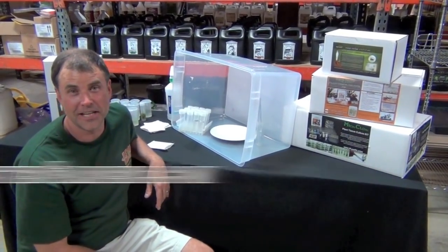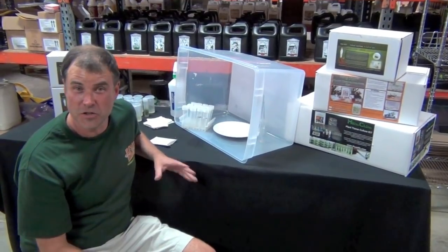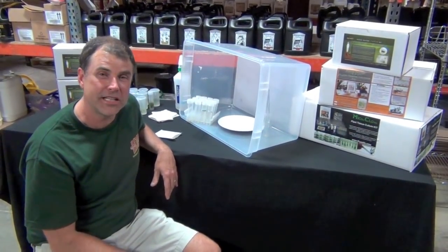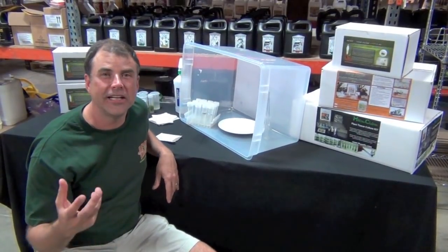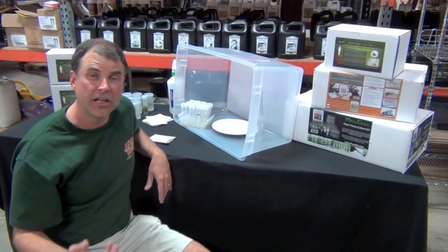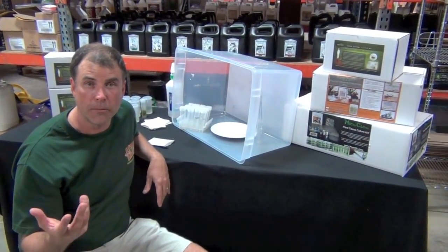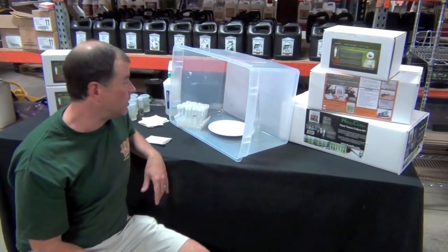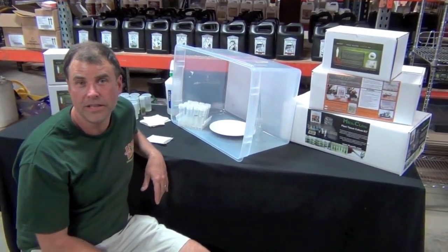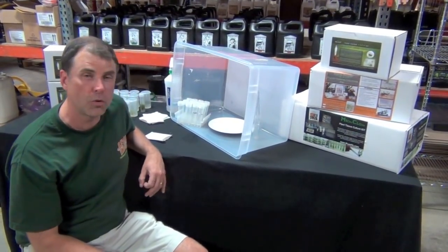You guys get to be the first ones to see this — this is brand new. What we've done is we have taken tissue culture techniques and created a seed starting kit for old seeds, or seeds that are valuable and just need an extra kick to get them going. It all started when I had friends come to me with like twenty-year-old seeds they had found in their tackle box. They knew they were plants they had really enjoyed, and they were really afraid that if they tried to germinate them in paper towels or even soil, they could possibly get fungus or contamination. The special part about tissue culture is that we're using elements like sugar to grow plants and also surface-sterilizing the plants so they don't have fungus and things on them — and these are the two things we're concerned with when germinating old seeds.